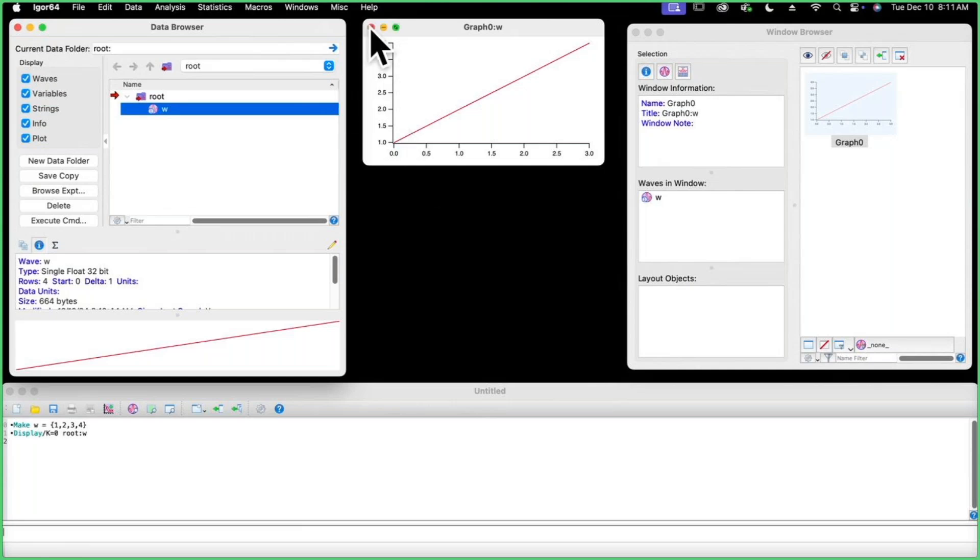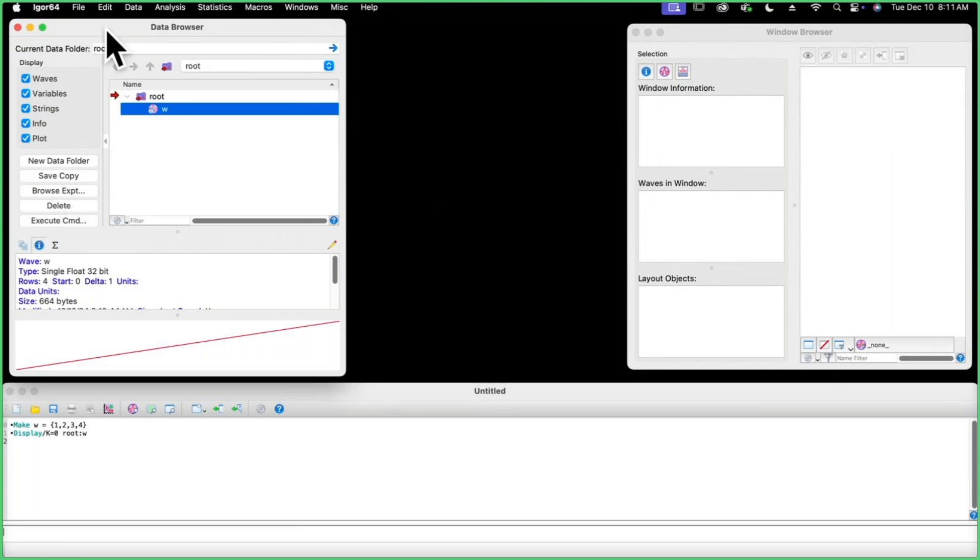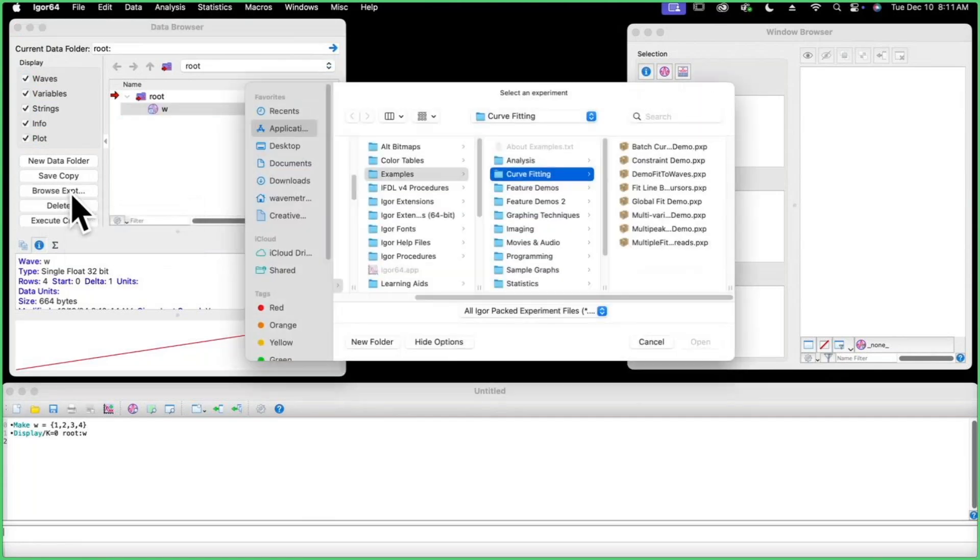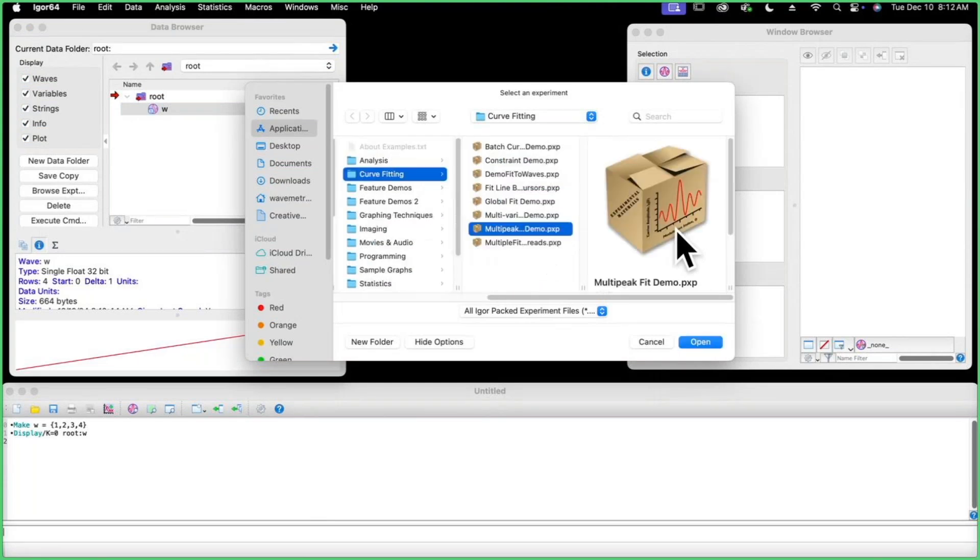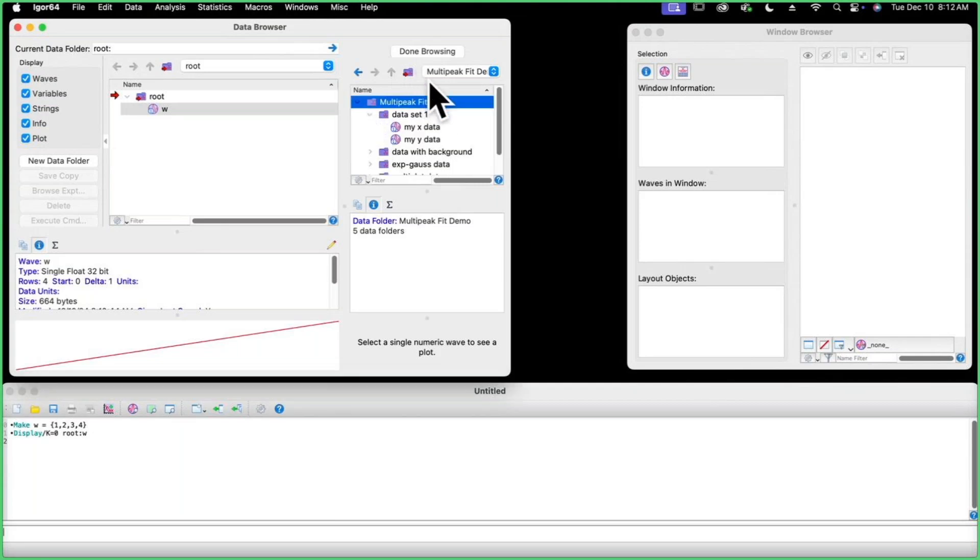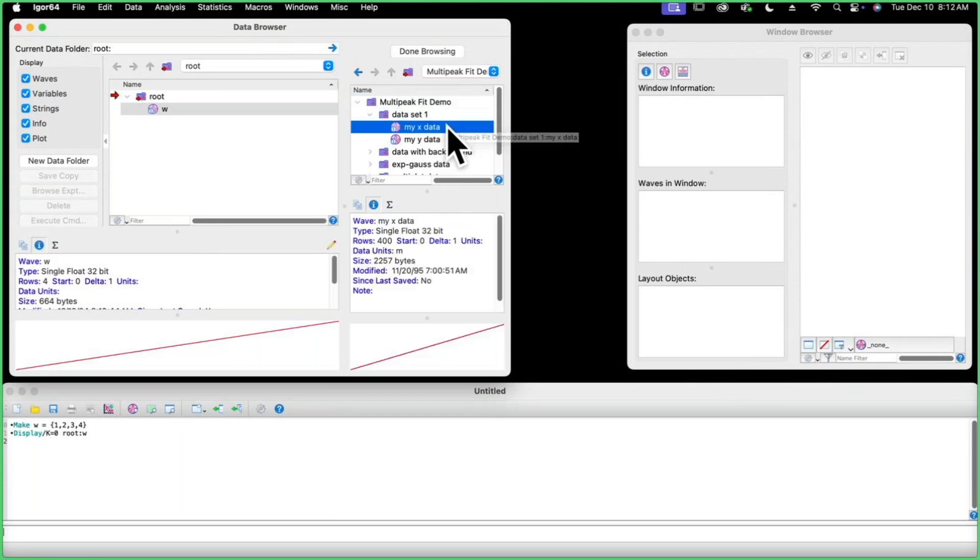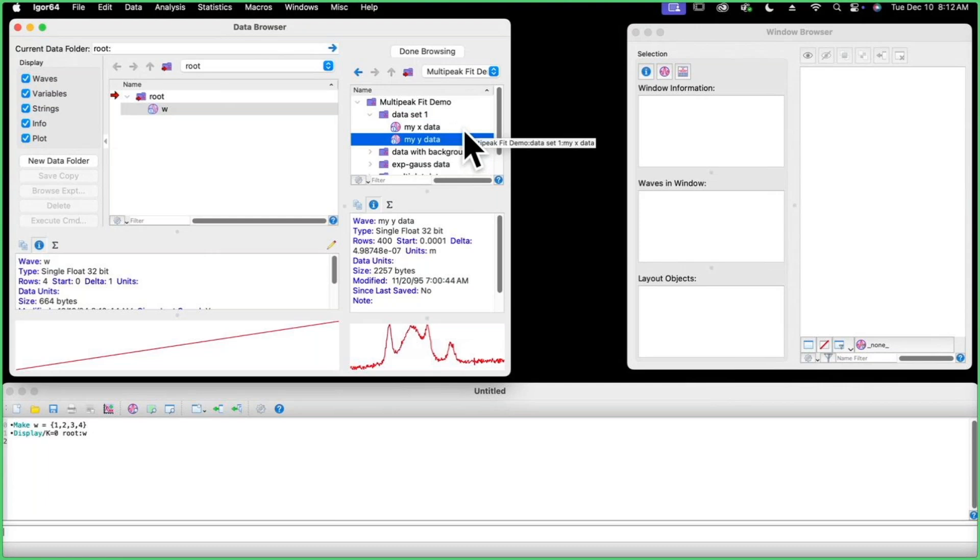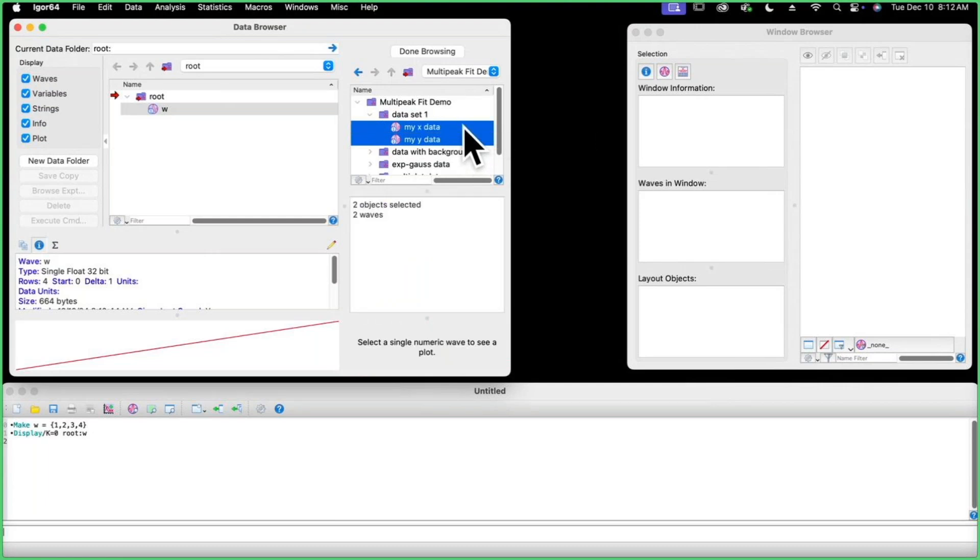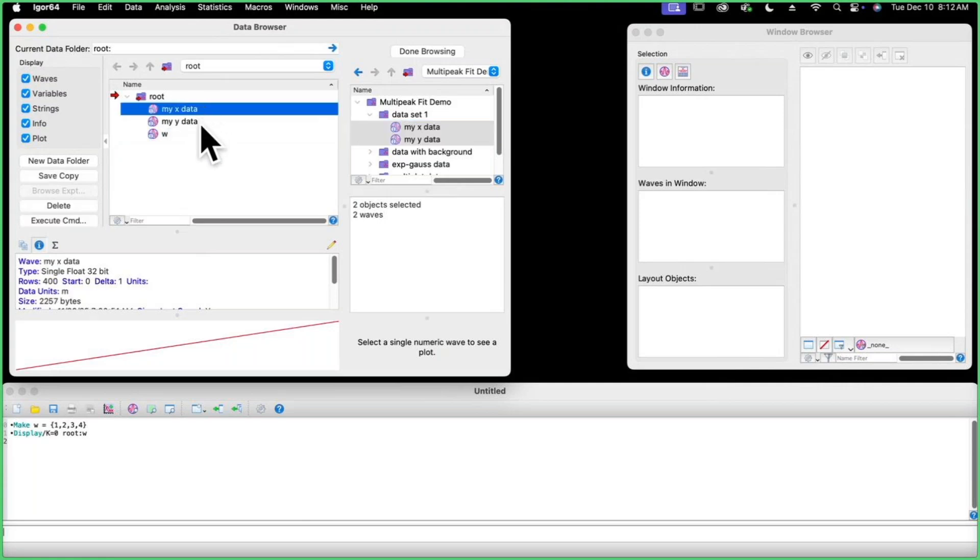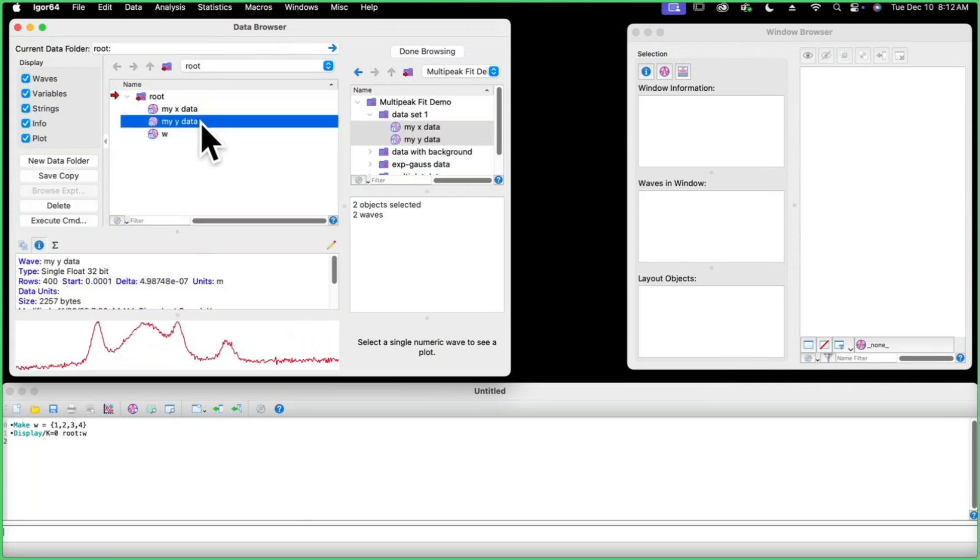It's very common for your data to already exist in another Igor experiment. A lot of people don't know it, but it really is dirt simple to copy data waves from one experiment to another. In the data browser, there's these five buttons and the middle one is browse experiment. If I click on that, I can pick one of the experiment files that ships with Igor, the multi-peak fit demo. We just open that up and you can see the waves that are in the multi-peak fit demo experiment are shown here. I want these my X data and my Y data waves. I'm going to use the shift key to select them both and drag and drop them into my root data folder. Here they are in my experiment.